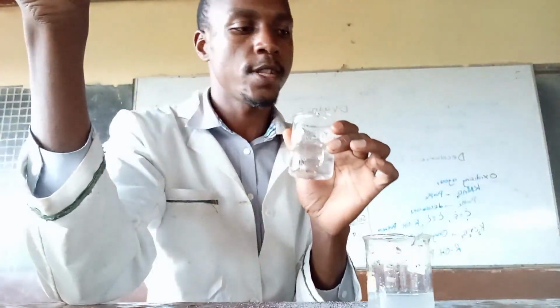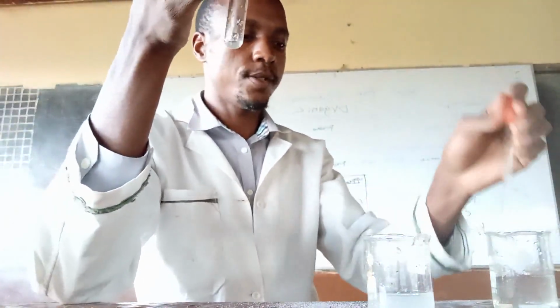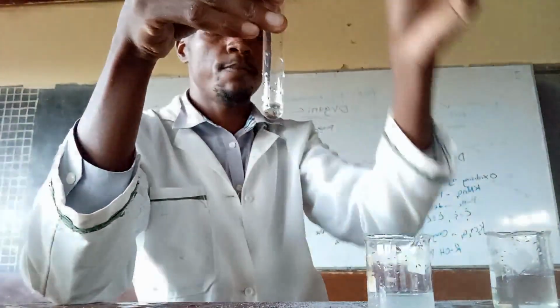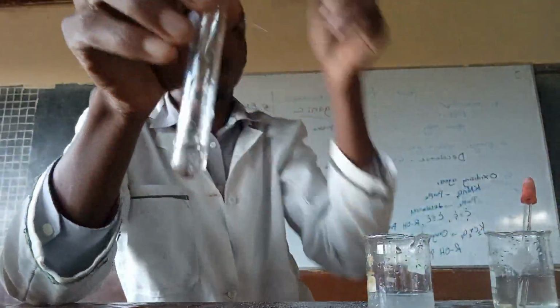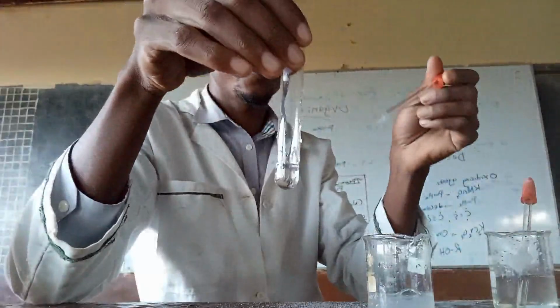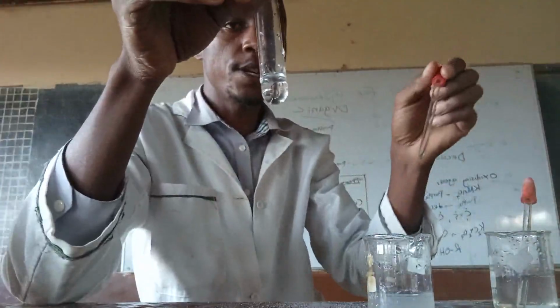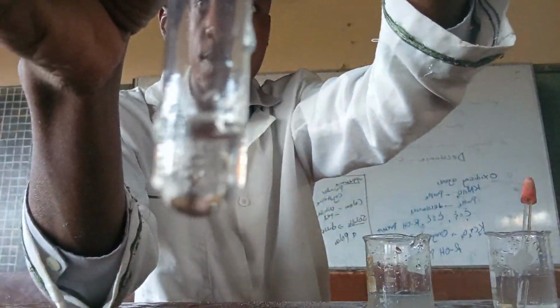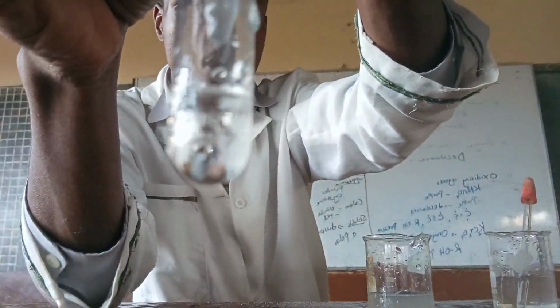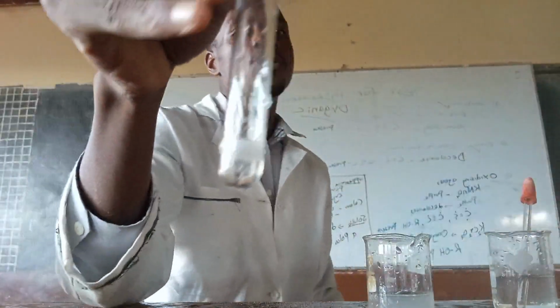and we wish to test for the kind of anions which are in here. Into my portion, I have my portion here, about 3 drops of barium nitrate. So I add them here. See? 1, 2, 3. White precipitates. You don't have even to shake.